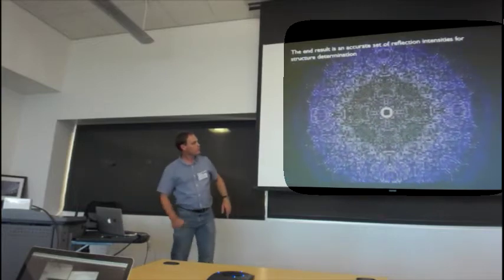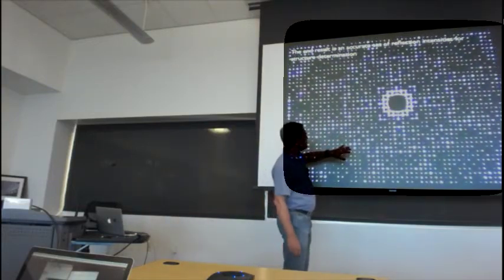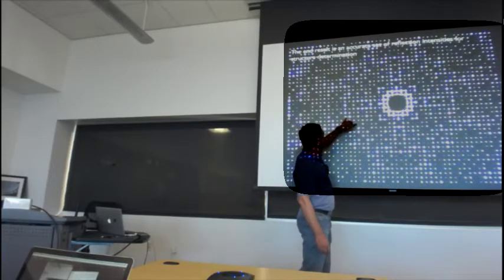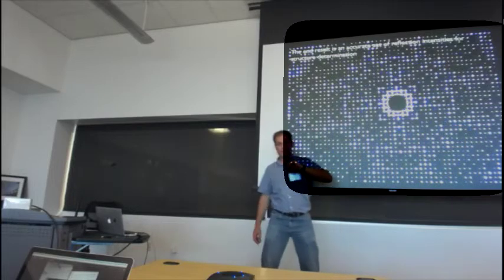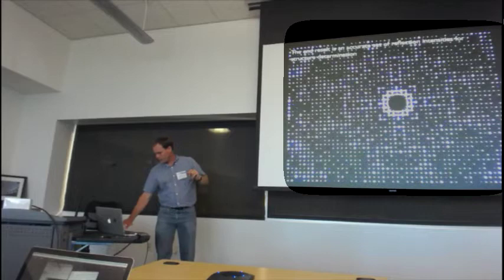If you take a look a little bit closer. This is like 150,000 diffraction patterns merged in 3D. And what you want to do is come away with nice measurements of these reflection intensities for your analysis. But that's the subject of something else.